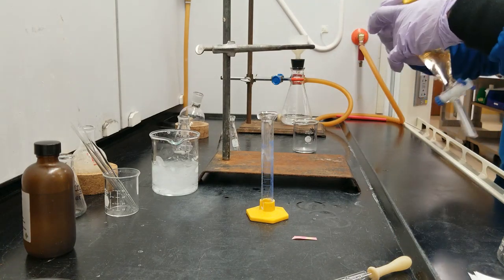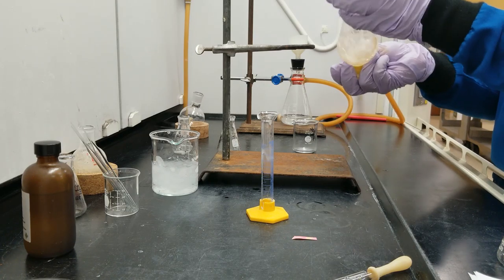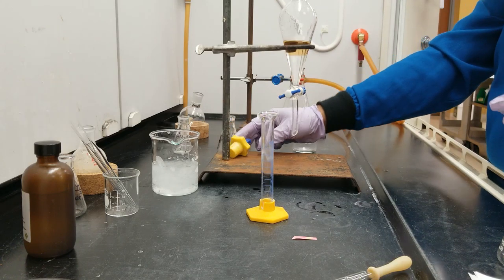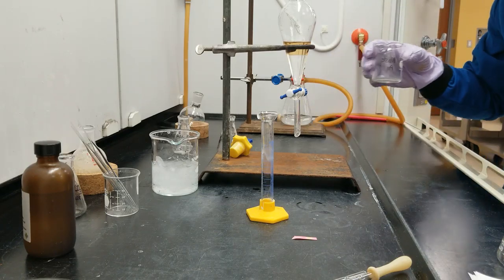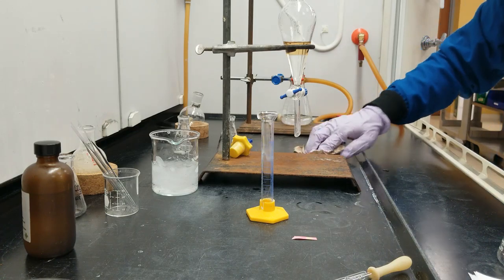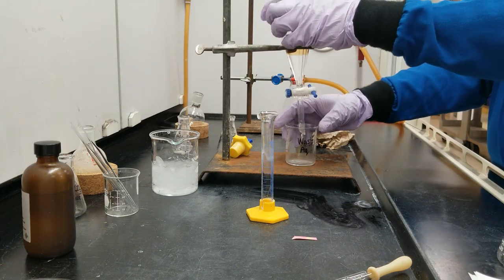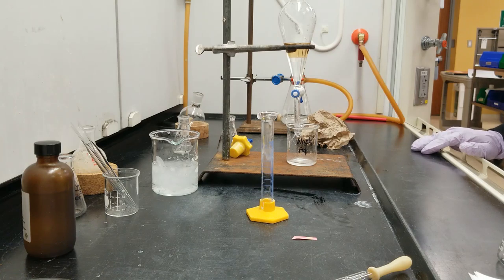I will give it one more round of shaking, and then we are good to go. Cap comes off. The bottom layer is the aqueous layer and the top layer is the organic layer. We do not need the aqueous layer at this point because our solid of interest, 2-naphthol, is already transferred to the ether layer, so we consider the aqueous part as waste and collect it in a beaker marked aqueous waste. We let the water drain out.